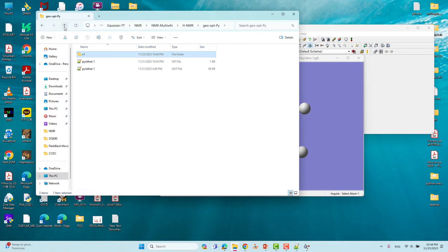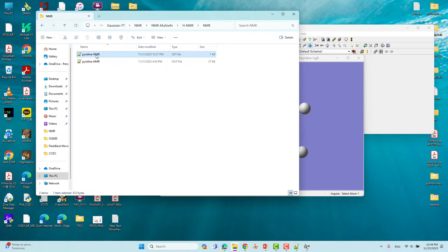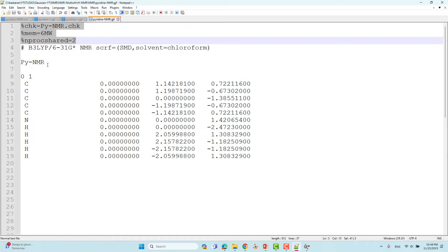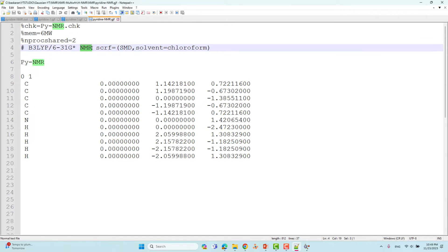I have already prepared the NMR calculation input and output files. This is the input file for proton NMR calculation. It is similar to the optimization input. Here you have to add the NMR keyword. When you simply type NMR, Gaussian will use the GIAO method by default. If you want another method, type NMR equal to that method name.